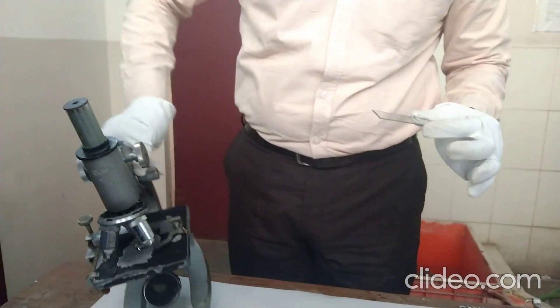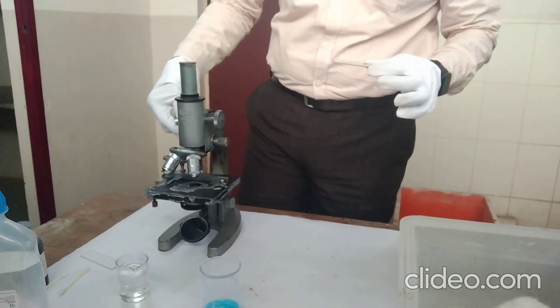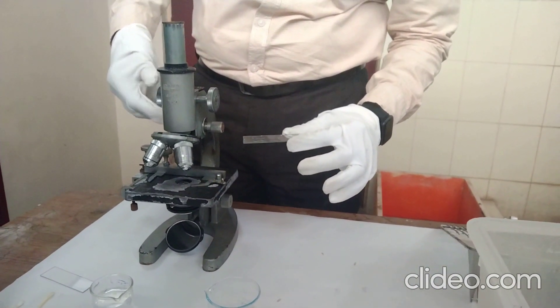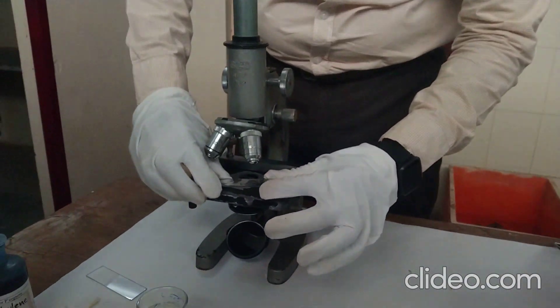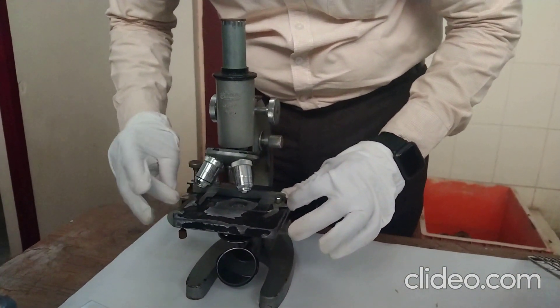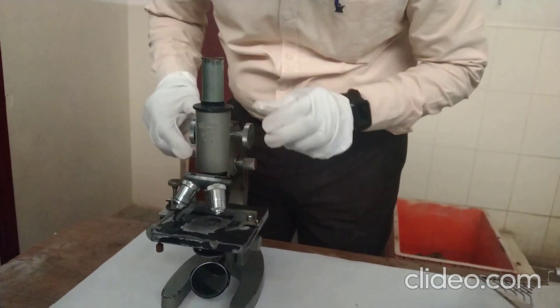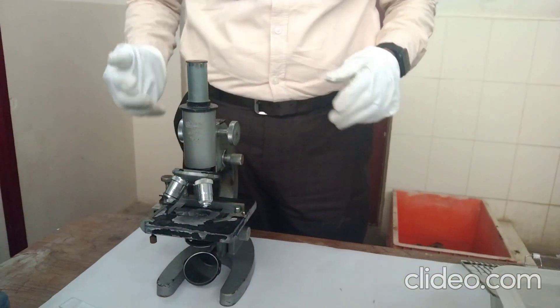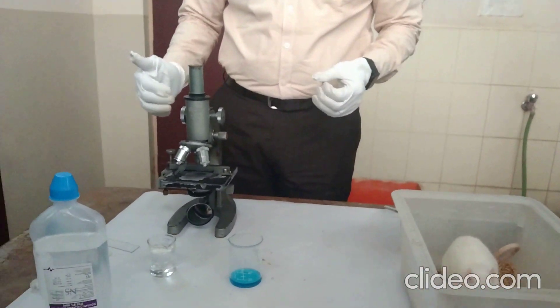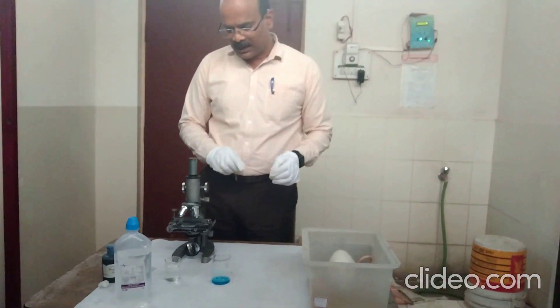Once it gets dried, you can focus the slide under a microscope. You can use 10x or 40x magnification to get a proper view of the estrus cycle stage. From the microscope, you will find the stage of the estrus cycle. You can then correlate the findings of this microscopic slide with the available literature to determine what stage of the estrus cycle is present.